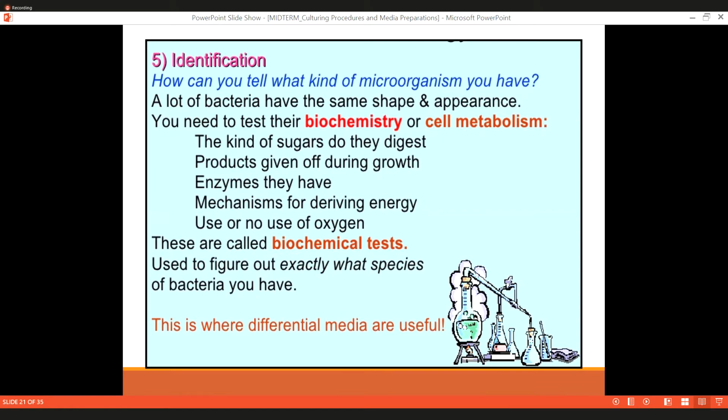So before you conduct your experiment, class, it is good that you research the required information that you need to know before conducting such an experiment. You should know the characteristics of the microorganism you need to study. You should know what it looks like, so that when you identify it, you know that it matches the appearance, so it's good.